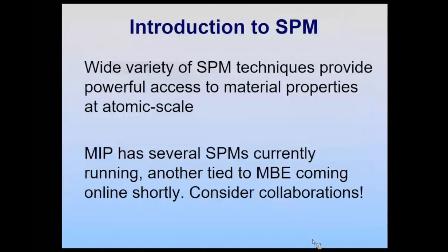So with that, I will end. I hope that I've shown you today there are a wide variety of SPM techniques, and they give you powerful information about material properties at the atomic scale.